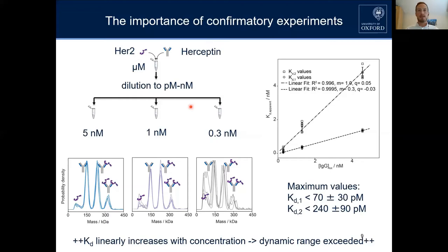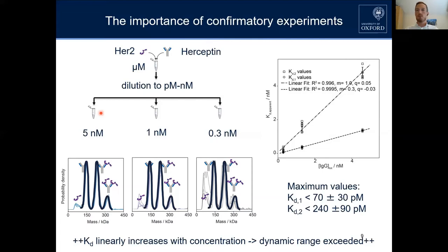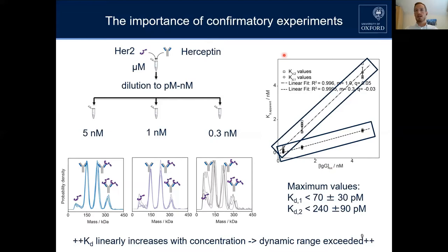What we observed was that independent of concentration, our data looks always the same. When we quantify that more precisely, we see a very strong linear dependence of KD on concentration, which should obviously not be the case. This is a clear indication that the interaction is too tight for us at these concentrations — we would need to go to much lower concentration.